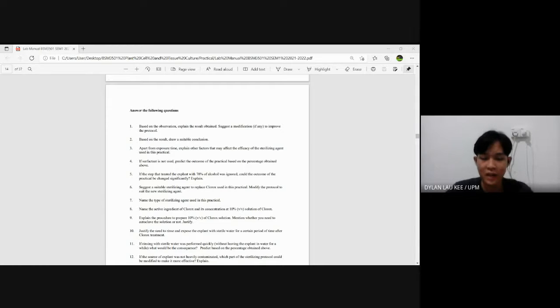This is because the alcohol has antimicrobial properties by denaturation and dehydration of protein, and thus could remove the organic materials found on the surface of the leaves effectively. The immersion of the leaves in 70% ethanol prior to immersion into the sterilizing agent also further increases the efficacy of the sterilizing agent by removing air bubbles on the surface of the leaves.